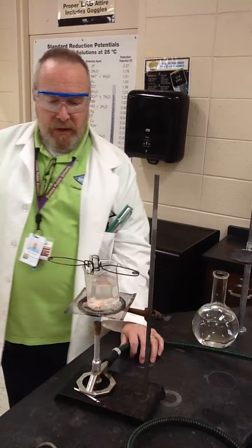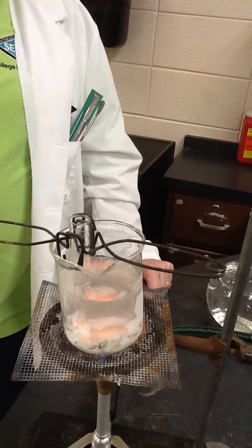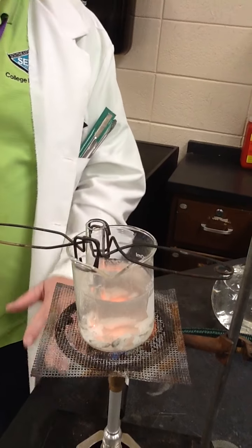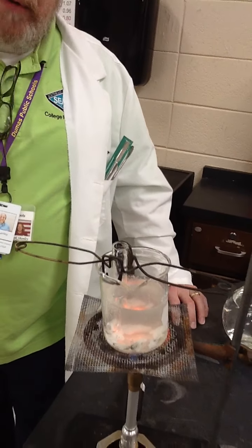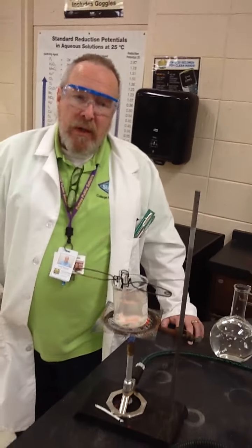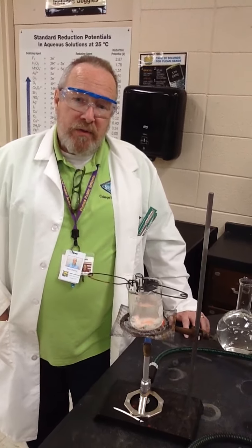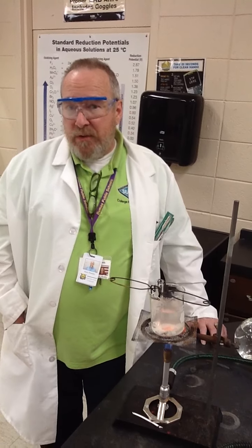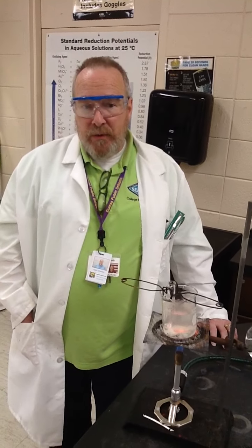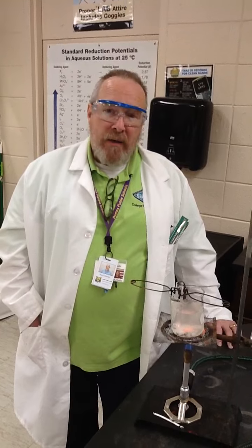You may not be able to tell, but this is starting to boil at the bottom, and because we have boiling chips in there, we don't have to worry about bumping this and having our whole contents come out. So we're going to finish our lab, and when it says place the test tubes in a boiling water bath, those are the steps you need to take. Those are the considerations you need to make, especially for your own safety. And as ever, if you have any questions, feel free to ask.